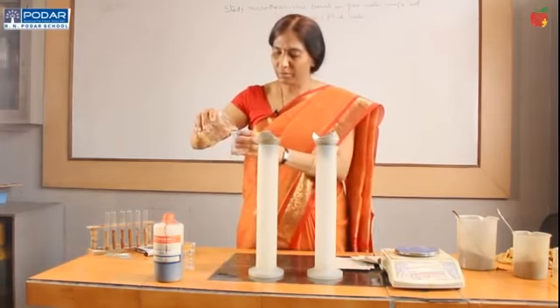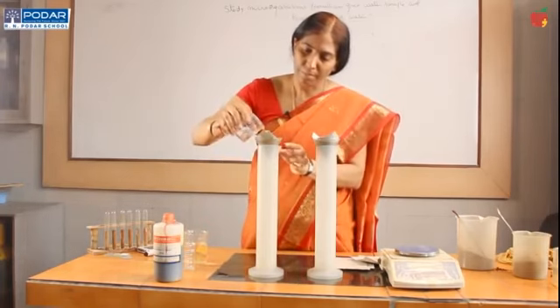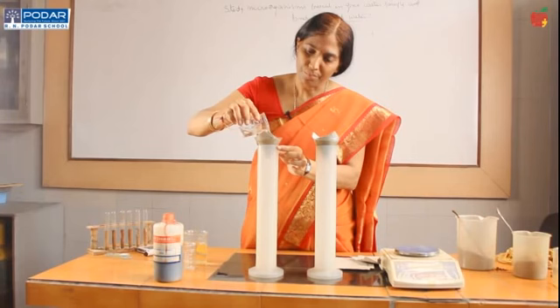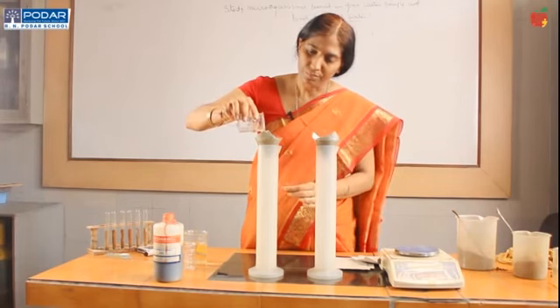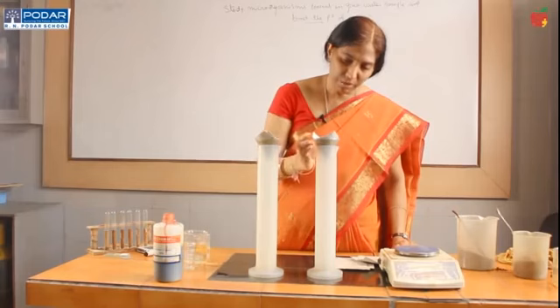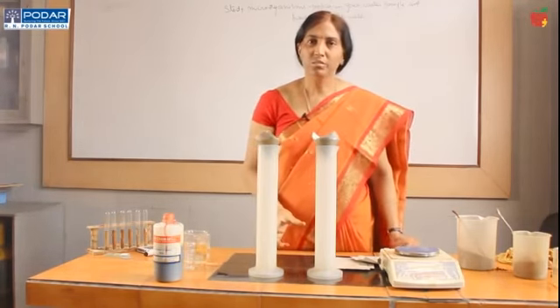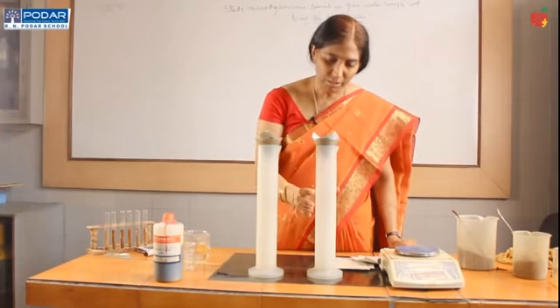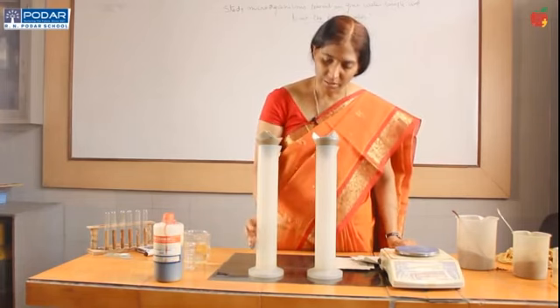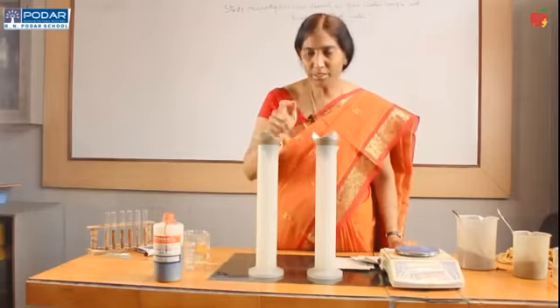Again 50 ml into the second cylinder also. After 10 to 15 minutes, water will be collected in both the measuring cylinders. Then we can find the difference, which cylinder has more water and which has less. That will show the water holding capacity of the soil.